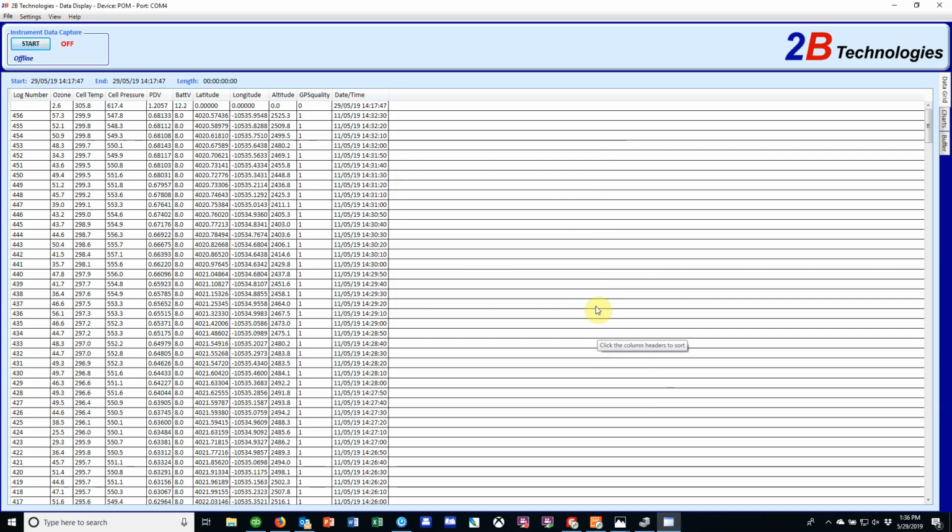This concludes the video of how to successfully transmit data using our 2B Data Displays application with any of our instruments.